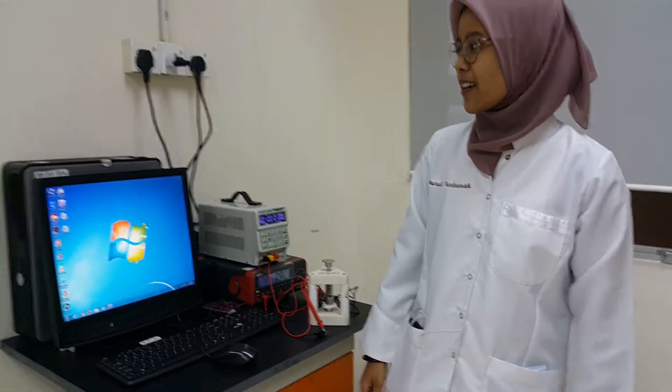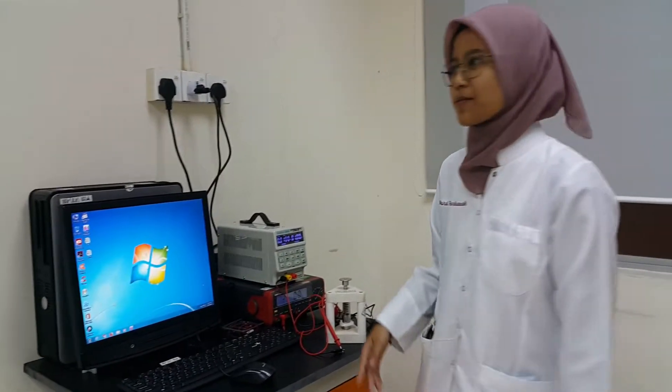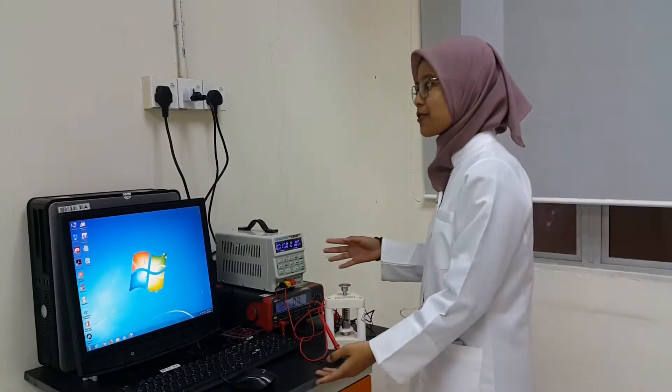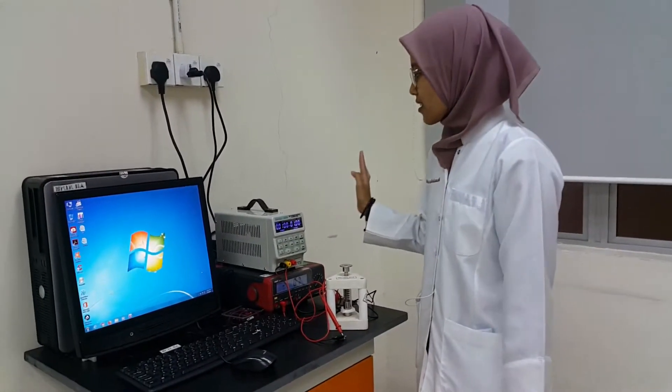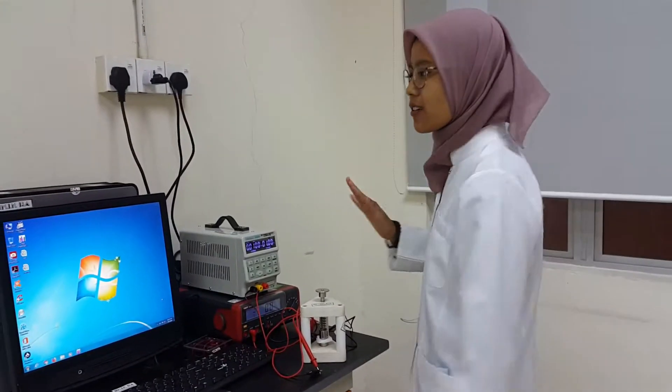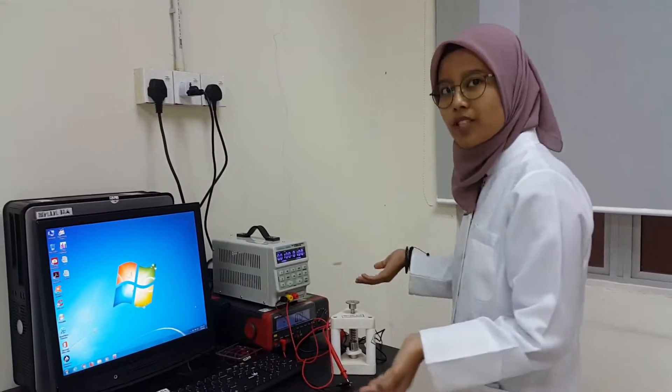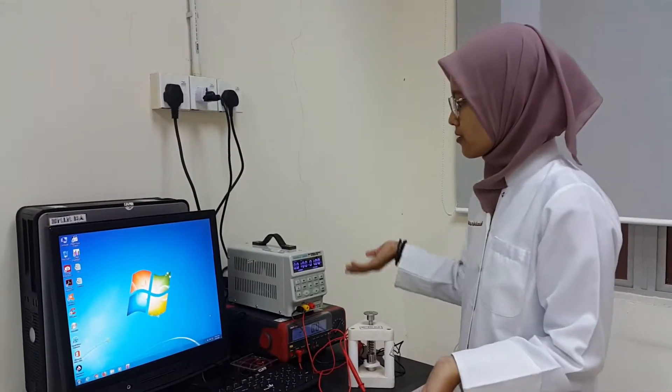Okay, so today I'll explain the setup for TNM. Okay, first of all, we have to make sure that all of the equipment is turned on.